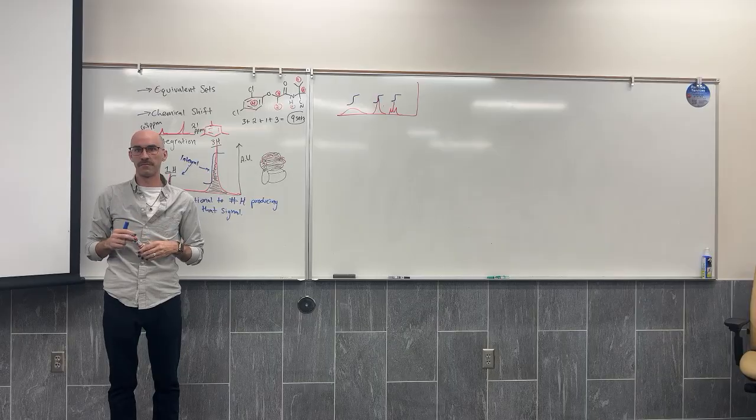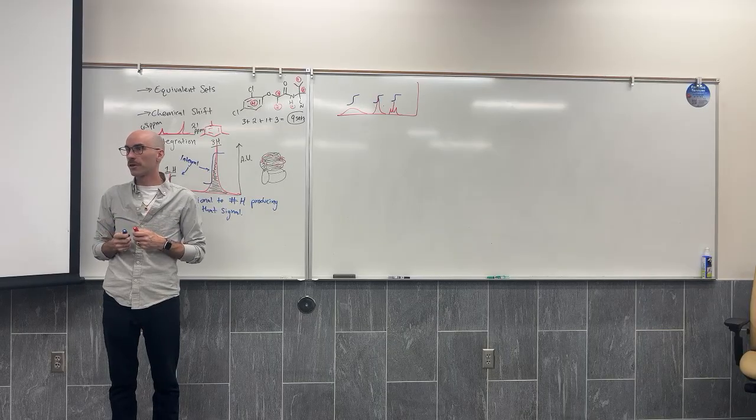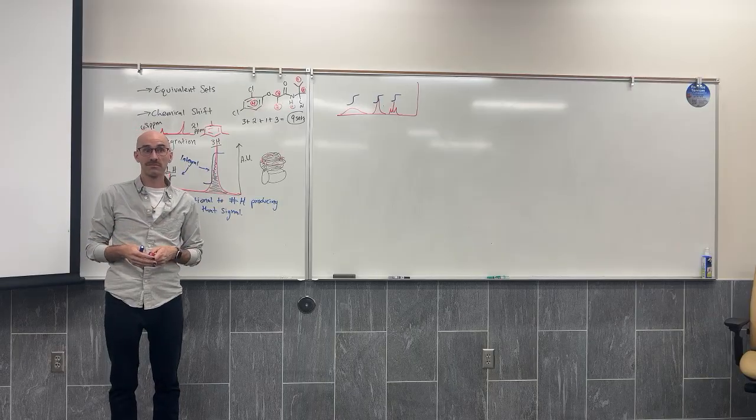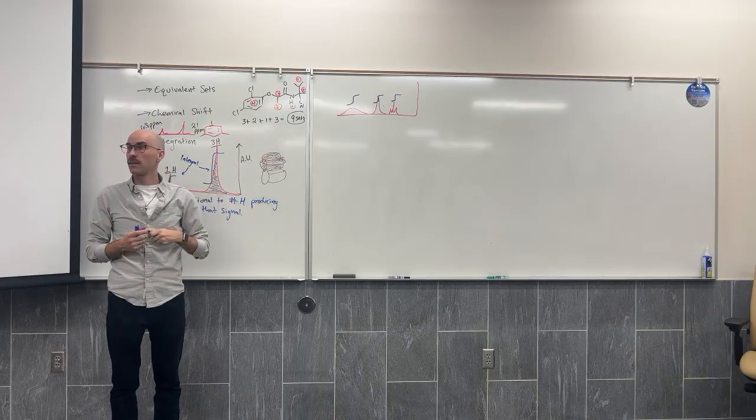They all look the same. They all have the same integration. How would we know whether the integration is 1H or 2H or 3H? We don't, based on this.